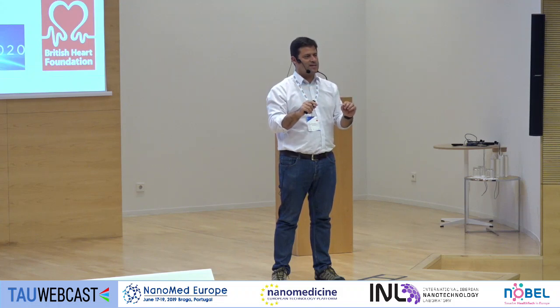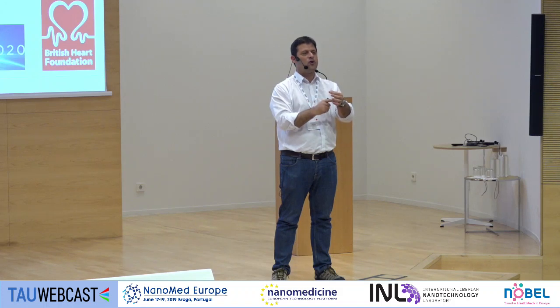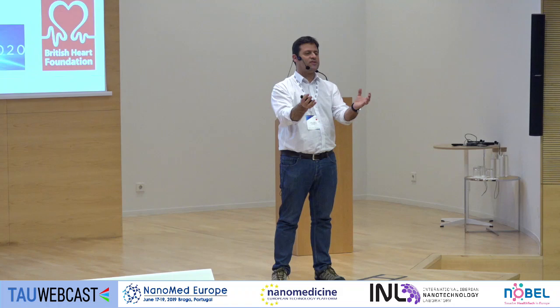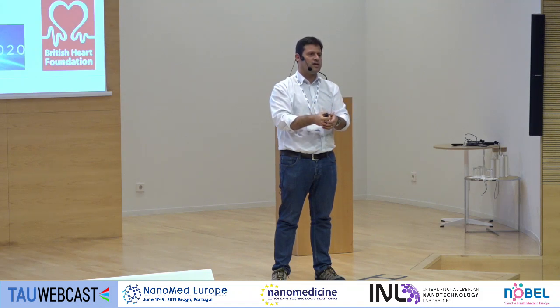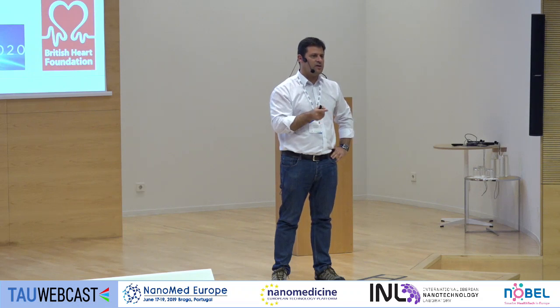If there are some studies showing that, and this is not our studies, for the erythrocytes, if the adherence is too strong, that would allow for the loss of that biconcave typical morphology of the erythrocytes, they will be stiffened by the interaction. However, if there is just that light attachment keeping the biconcave morphology, there are no changes on the interaction. So some studies from a group from Montpellier by other methods made that evaluation.